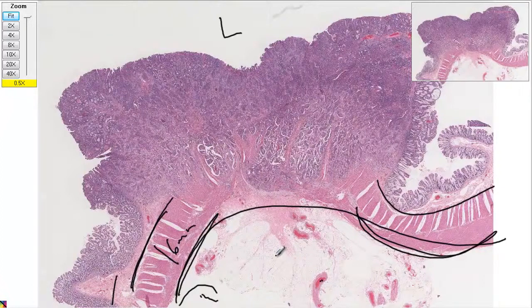You can see it goes up here and comes around here, but it's looking troubled all along this area. All this stuff once was probably a polyp, and now it's turned into this massive polyp. So we have the normal lining over here. This is where it's going dysplastic, looking a little bit bad. And now you've got these edges of dysplasia.